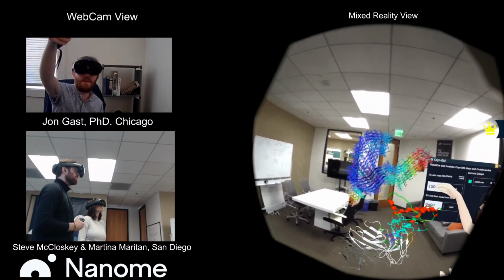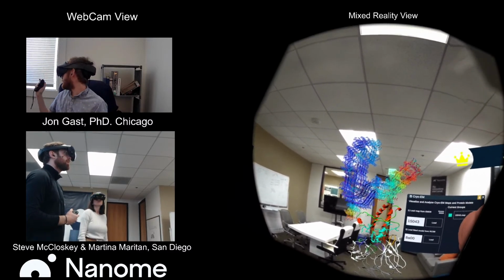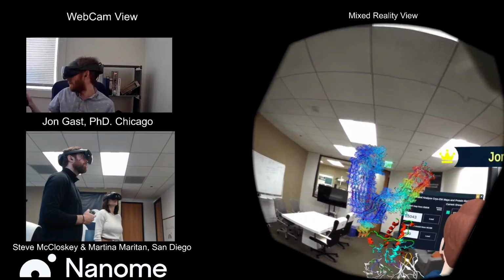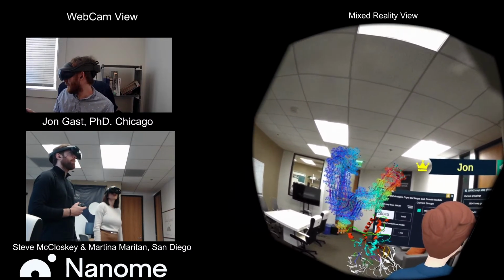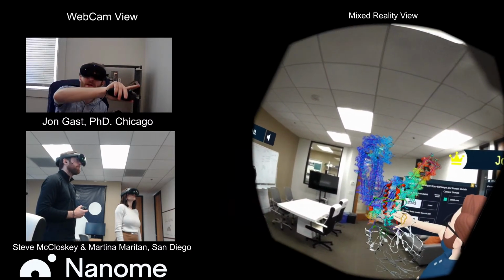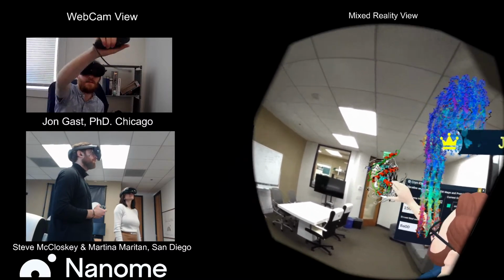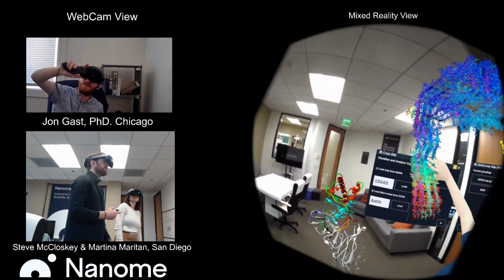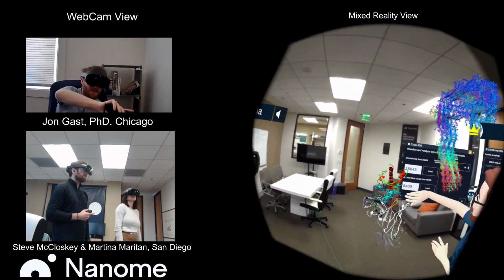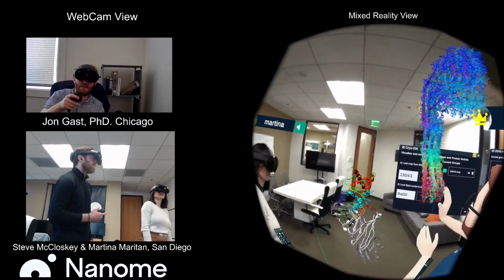From here, what we can already see is we've got the cyan right here. We can select just one of these chains, and box around selection. I'm also going to change the color scheme back to element. We can already tell here we have a long strand of the cyan. If we look here, we can see the cyan right along the prion when it's stacked. Since it's not able to form these beta sheets and it's being stabilized here, we can see that's really pulling it out and taking care of that. So we'll just wait a second. We can see it shrink.